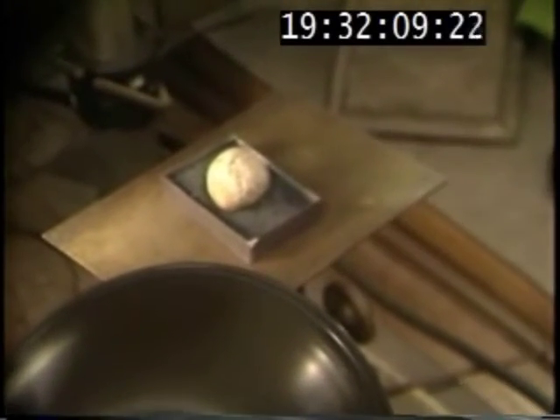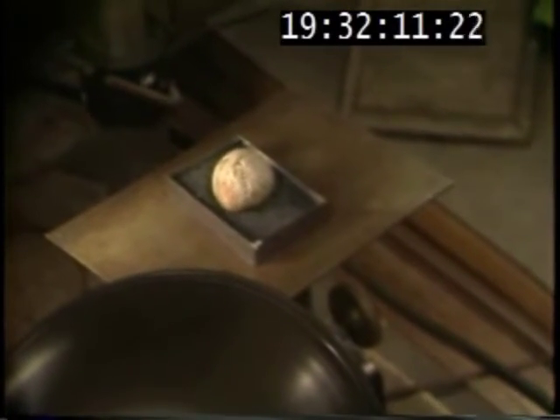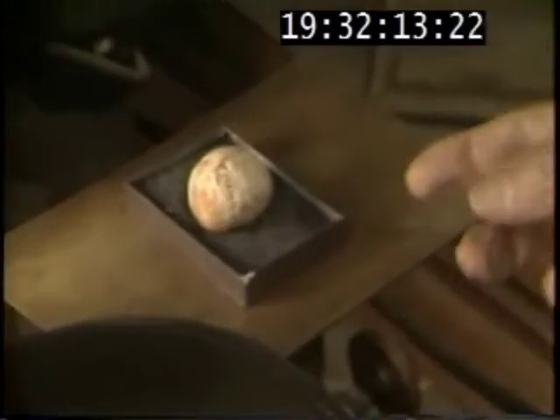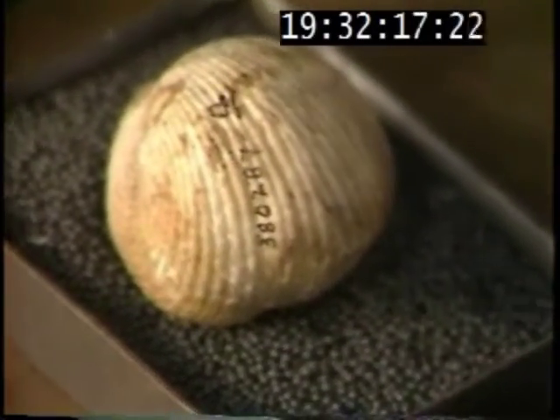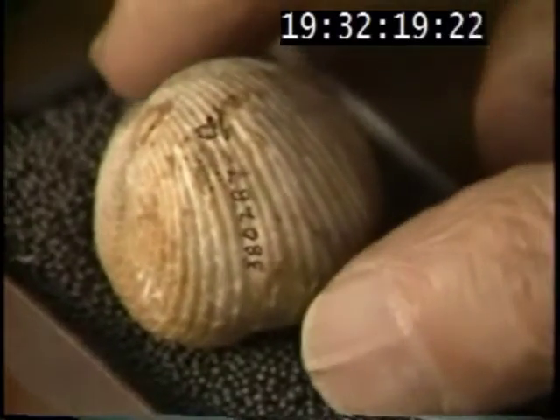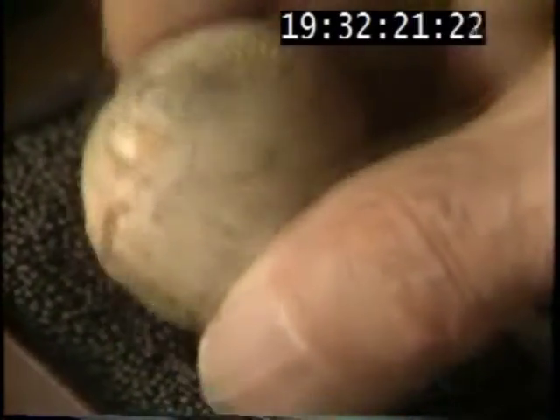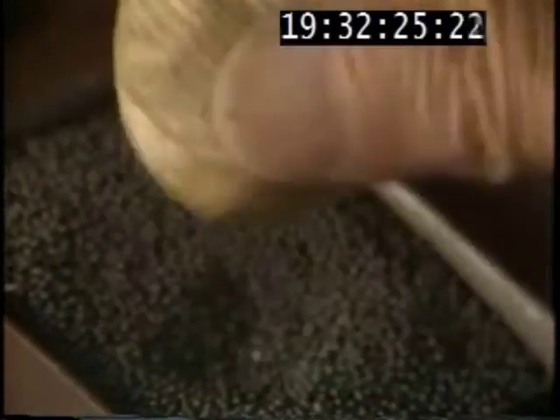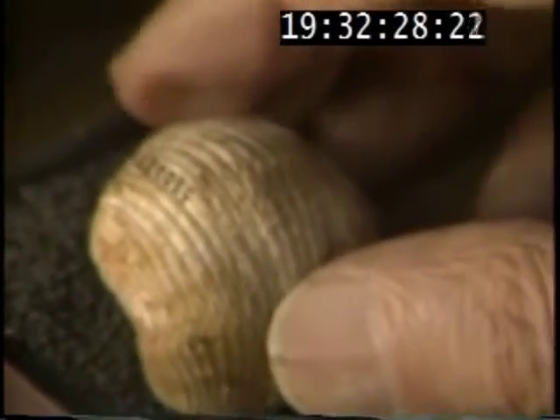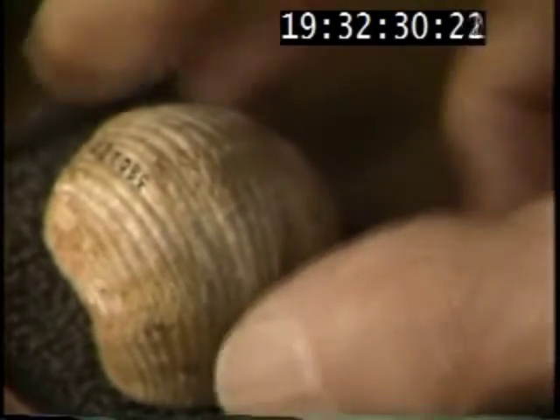With a brachiopod, we usually take, if we can, seven views. With this one we can only show five because I have no interiors. It's the dorsal view, side view, anterior view, posterior view, and a ventral view.